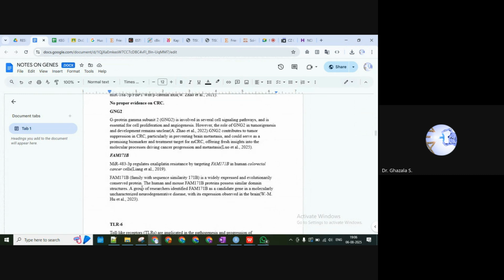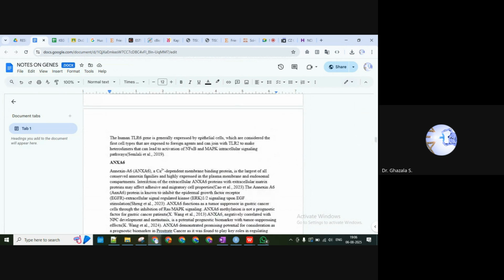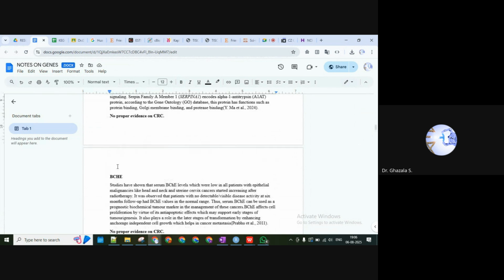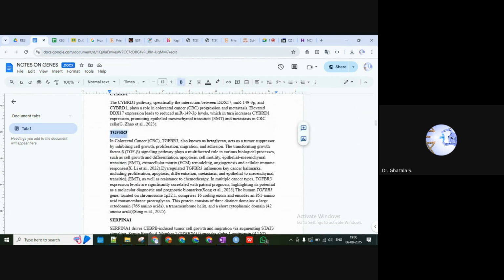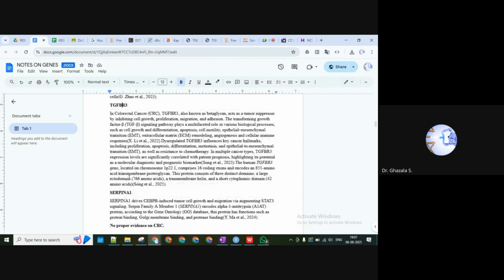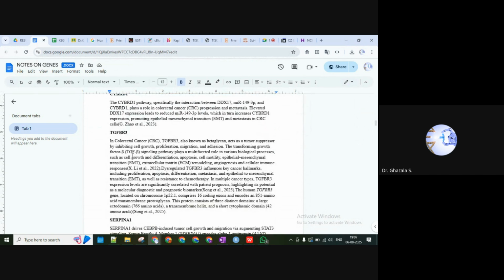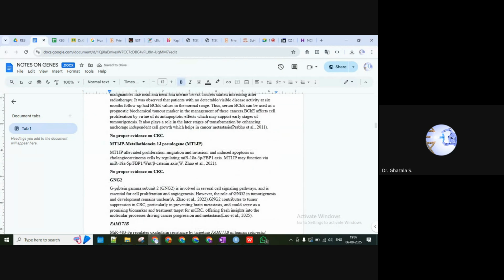We will select those genes which have evidence. The genes for which information is not there, that information is also not stored in different databases, which is why you are not getting it in the literature. So we are trying to skip those for which evidence is not there, and will work on the genes for which evidence is present, so that accordingly we can filter them.